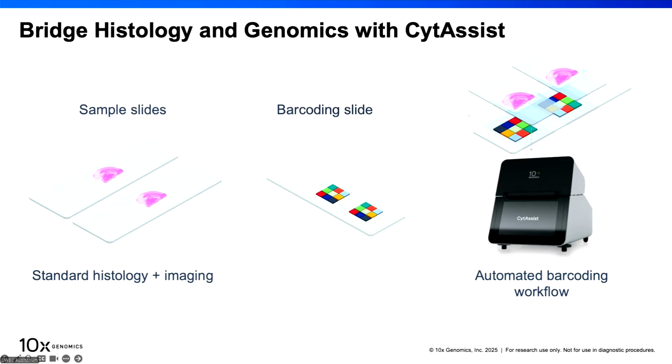You can just discard those samples and maybe prepare a different sample, but you are not committed to continuing the workflow. That was the original version of Visium, where the tissue was sectioned directly on the gene expression slide. At that point, you were committed.